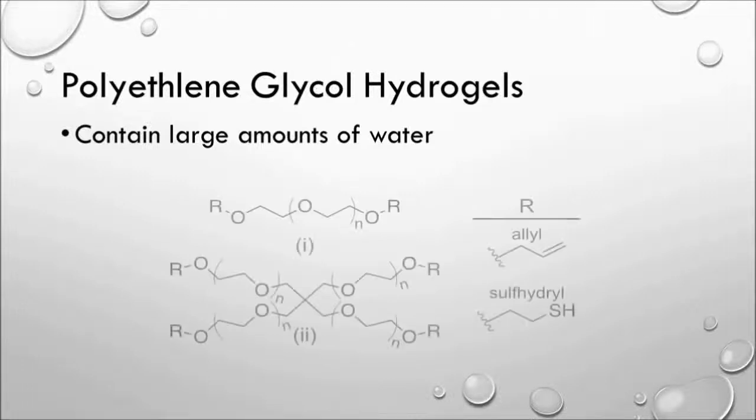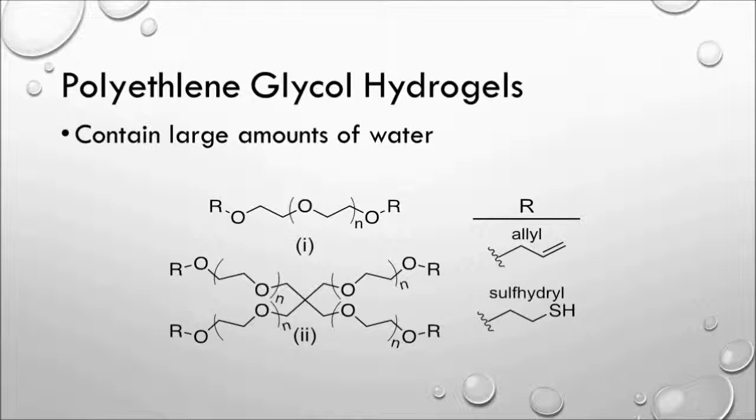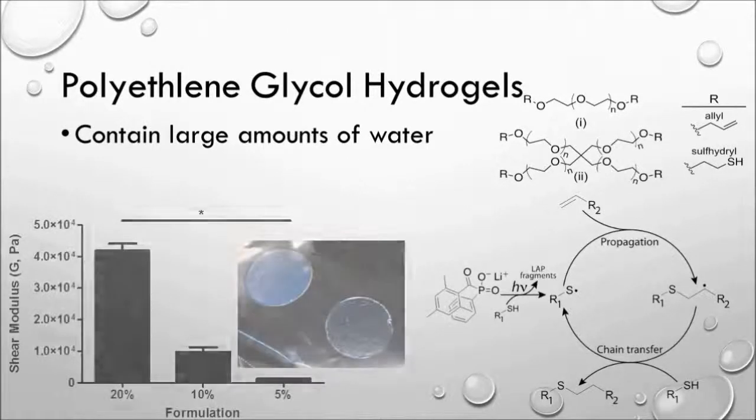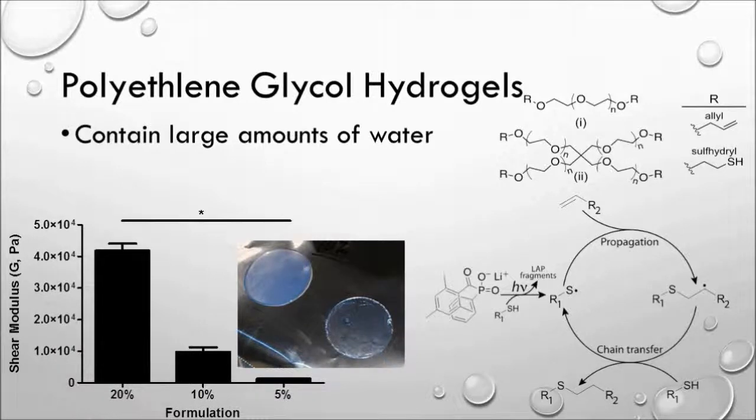We specifically decided to use polyethylene glycol, or PEG, as our backbone polymer, as PEG is very hydrophilic due to its structure. Using these two modified PEG polymers, we were able to design a photo-initiated and radical-mediated polymerization reaction to allow the PEG to self-assemble into the backbone structure of the hydrogel. We then tested the variation of modulus we could achieve with the PEG hydrogels using an ARG2 rheometer. This specific rheometer measures shear modulus by measuring the stress and strain on the hydrogel. After the precursor material is injected into the machine in between two plates, a UV light is shined on the precursor, activating the reaction, while slightly rotating one of the plates. Stress and strain measurements are then taken on the material, which gives modulus.